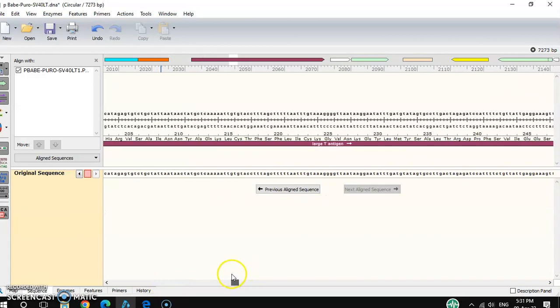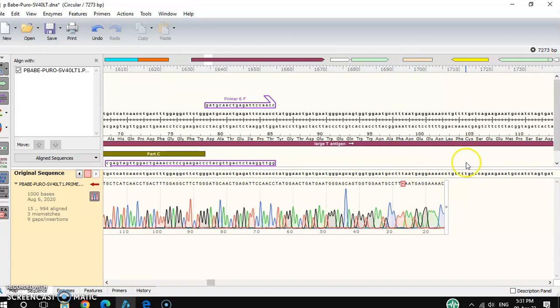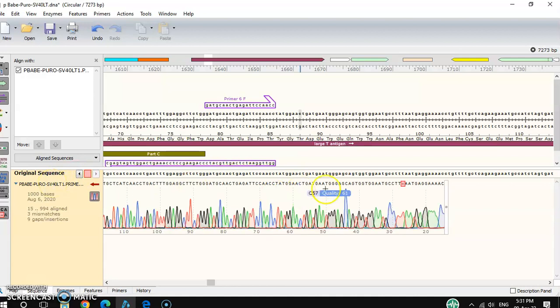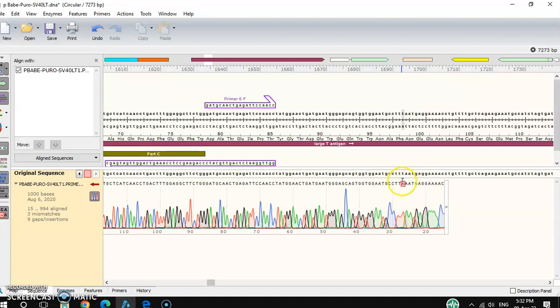For example, if you go to the starting part, you can see by taking your cursor that it shows positions 16 and 17 — this is the beginning of the sequencing result. There appears to be a deletion mutation here, but you cannot rely on it because it's in the unreliable starting region. To confirm, you would need to design another primer to cover this part.